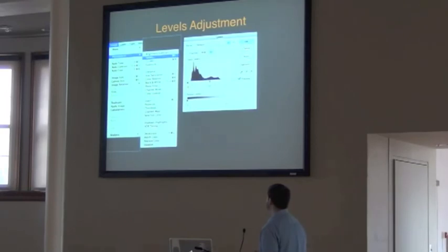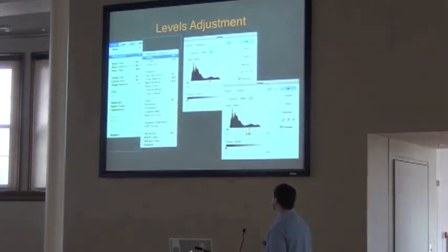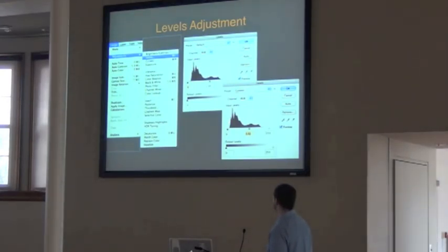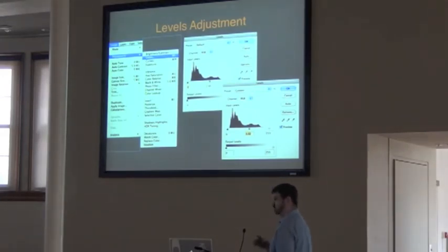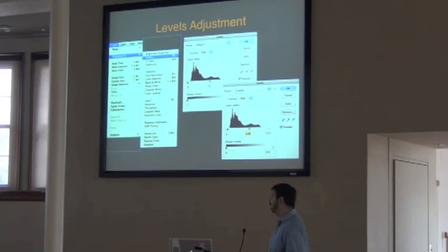For levels adjustment, this is also very minor. Typically we move the shadows over to where the histogram starts. Then the same thing with the highlights — it's not always appropriate to move it all the way over; you have to get a feel for that. And then adjusting the midtones just to get it looking like it should when you're working on a specimen.